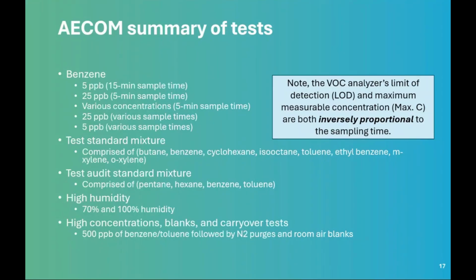Okay, this slide summarizes the different tests that were conducted. First I'll go through different benzene-only tests that were run. AECOM was varying the concentration and/or sampling time. And just keep in mind that the VOC analyzer's limit of detection as well as maximum measurable concentration are both inversely proportional to the sampling time.